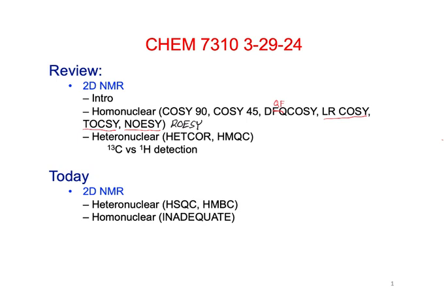The advantage to that is, I think we talked about a little bit one time, the amount of NOE versus, and this is simplified, the molecular weight of the compound.